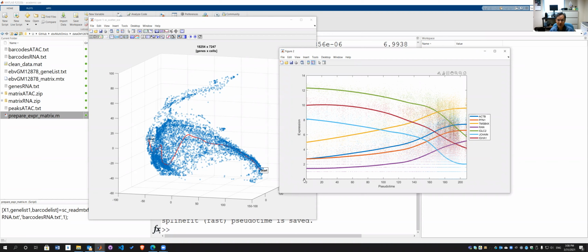So we start from time 0, pseudo time, which is the time point on this plot here. And all the cells in this group, if we look at the green gene, which is IGLC2, all the cells in this group have a relatively high expression level, normalized to about 12. And then this pattern decreases. This expression level mean decreases with the increment of the pseudo time.